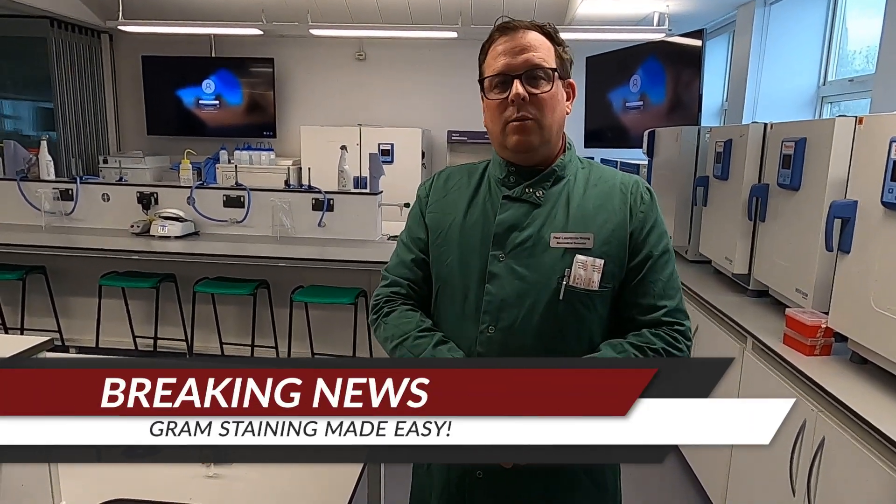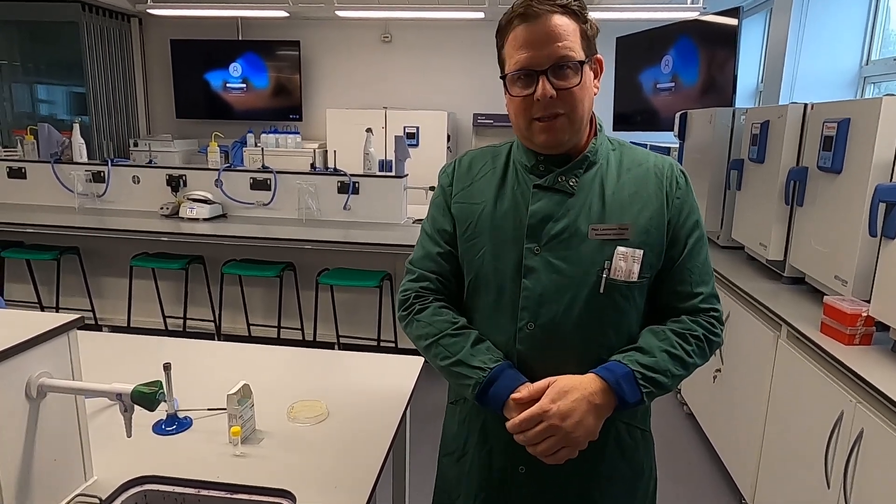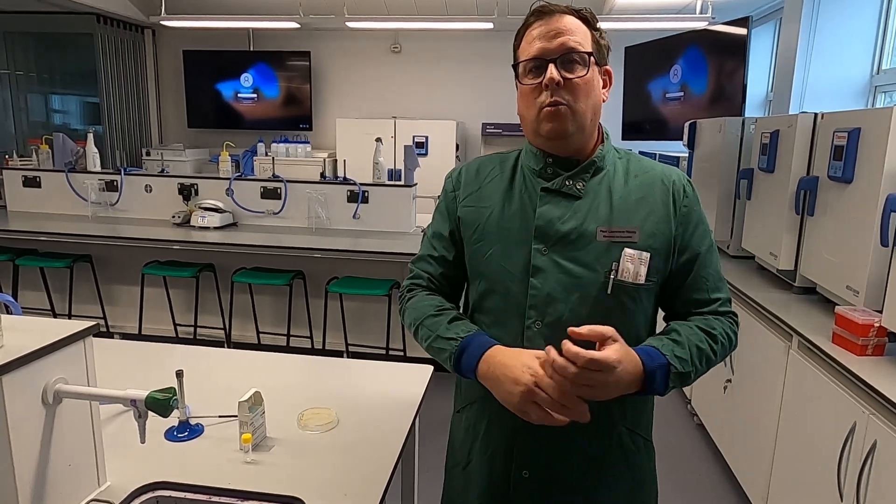Hi, my name is Paul and today we're going to show you how you go about isolating a single colony from a bacterial plate and then performing a gram stain. A quick and easy technique that starts to allow you to work out what particular species you may have in front of you.